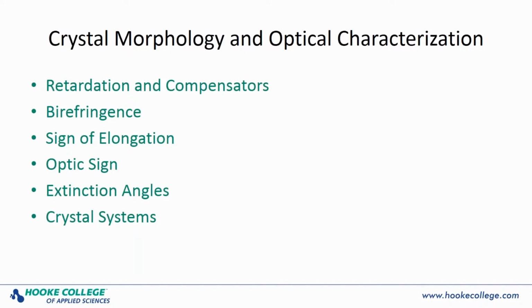When viewed through cross-polarized light, achieved by placing one polarizer below the sample and another polarizer above the sample, the second oriented 90 degrees relative to the first, a particle with more than one index will exhibit interference colors, known as retardation colors. These colors make up what is known as the Newtonian series of colors, commonly observed in thin films such as soap bubbles or a spot of oil on pavement.